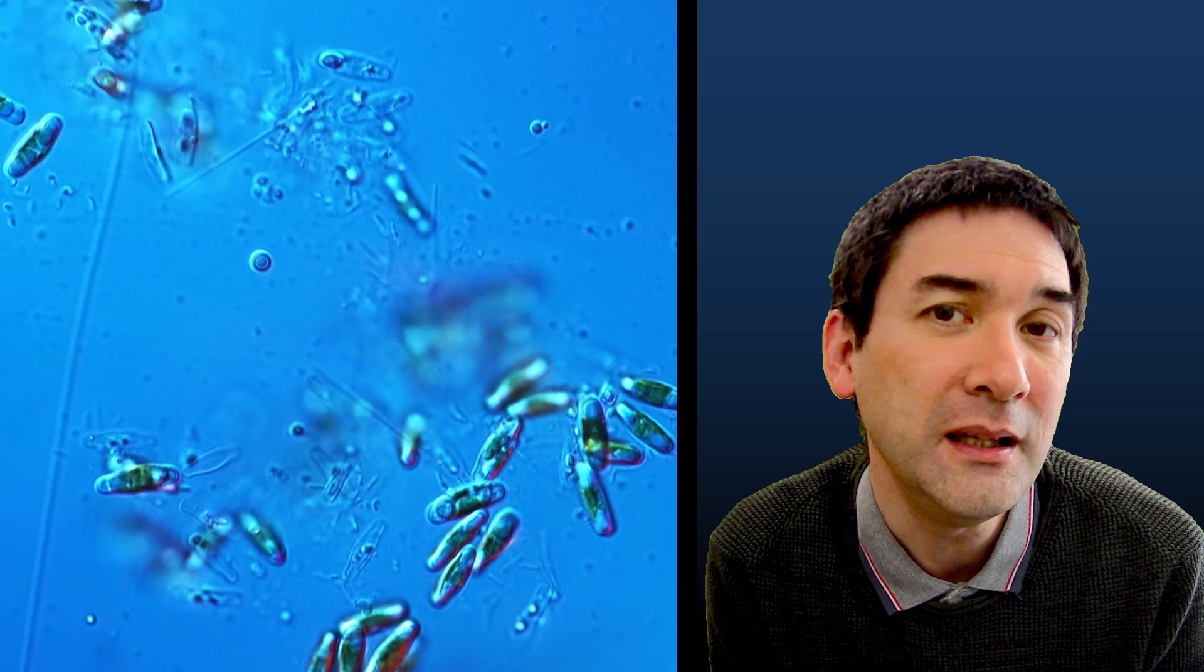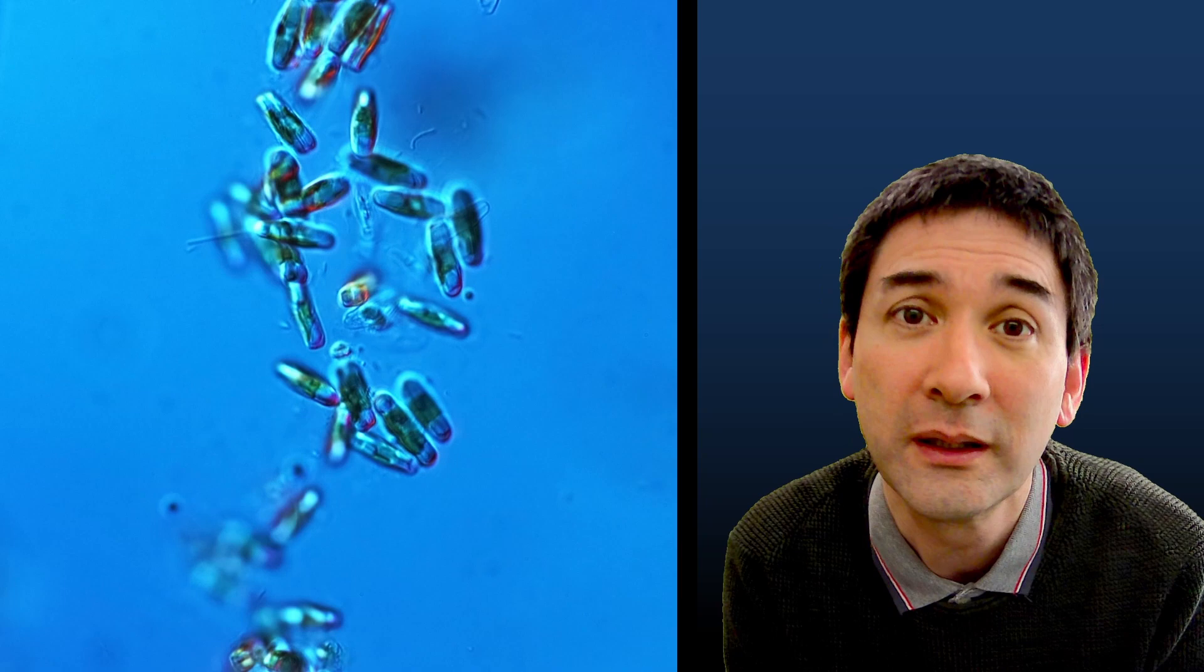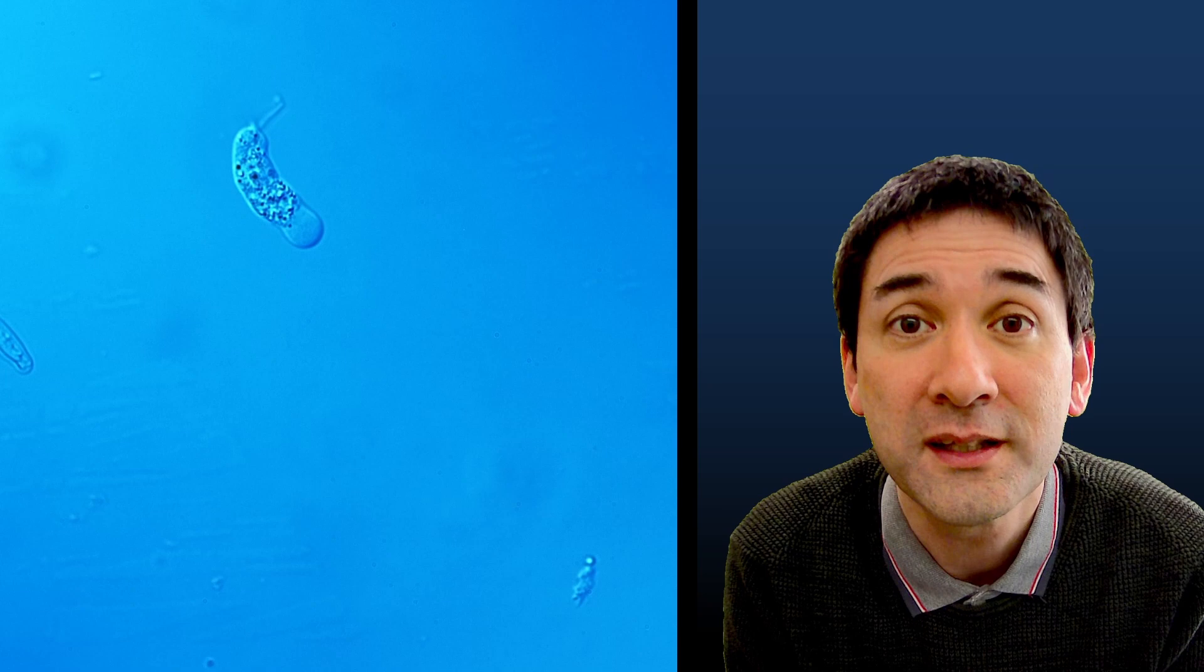Now, in the biofilm, I could also find quite a few other things as well. Like, for example, the shells, I could find some cellular debris, a lot of unidentified material as well. So I knew that I had to be a little bit patient in looking around a little bit longer to find something interesting. And sure enough, look at this. I could not believe it.